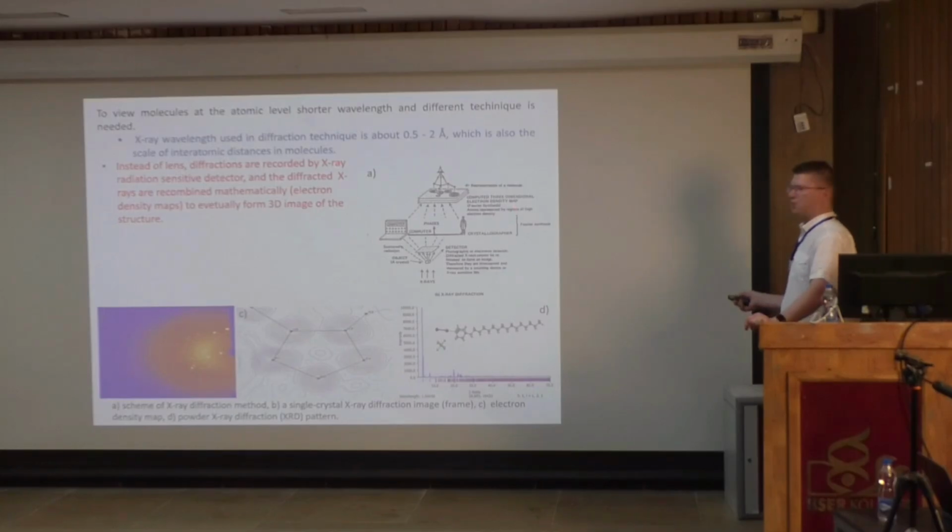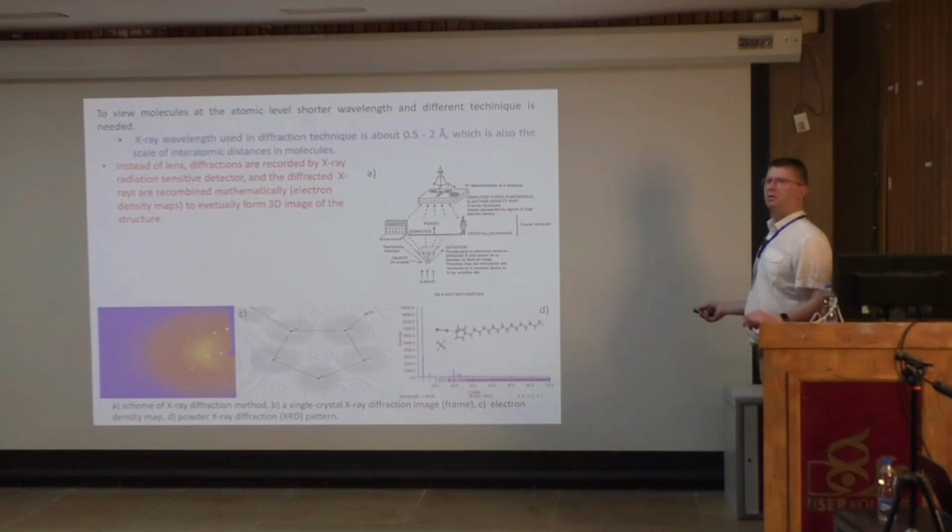So there are a lot of different steps that we are doing. In this course, we go a little bit into the theory of what happens and why this happens. We look at the crystals, how they look, we learn how to make them, then if we can get this done, we get the data, and what can we do with it with the computers, and so on.